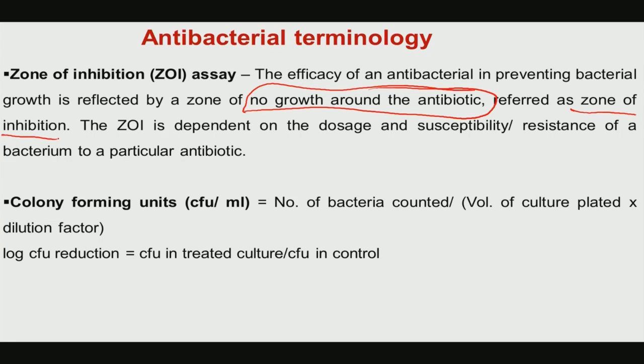Let us say there is an antibiotic drug A, and you want to understand what the dosage X or dosage Y is, like the minimum inhibitory concentration, which can be assessed for the ZOI or for the MBC.